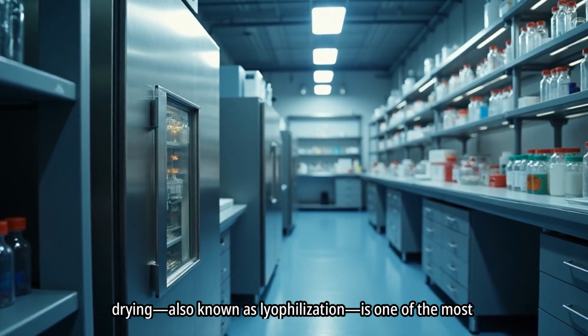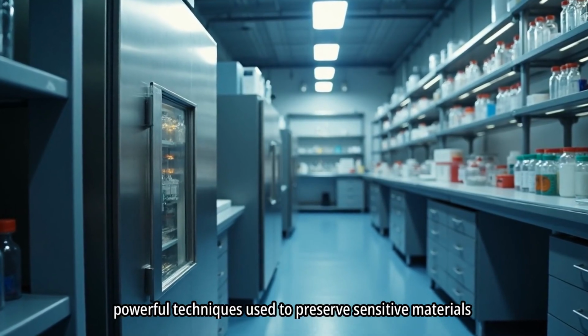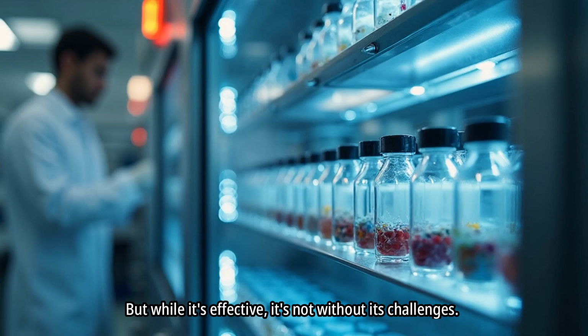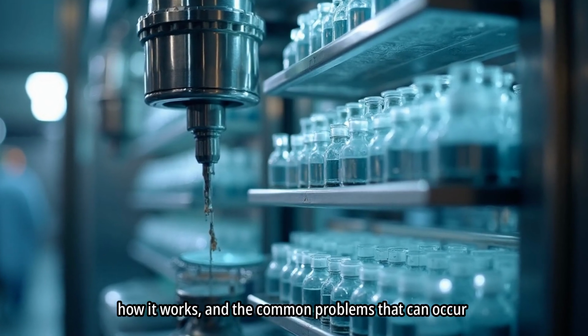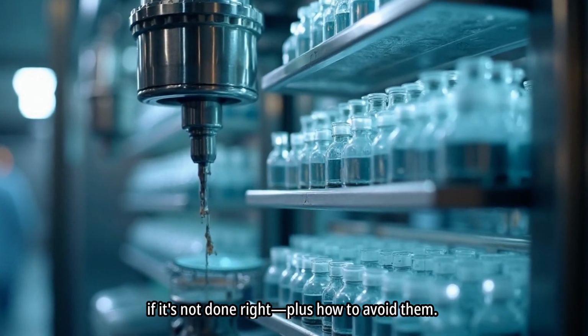Freeze drying, also known as lyophilization, is one of the most powerful techniques used to preserve sensitive materials like pharmaceuticals, food, and biological samples. But while it's effective, it's not without its challenges. In this video, we'll explore what freeze drying is, how it works, and the common problems that can occur if it's not done right, plus how to avoid them.